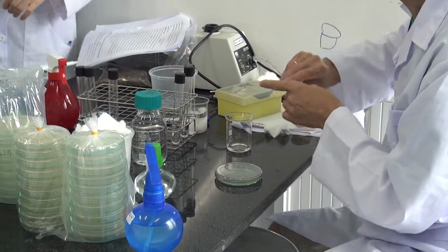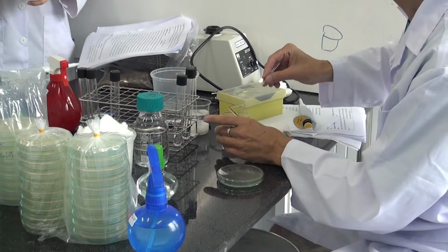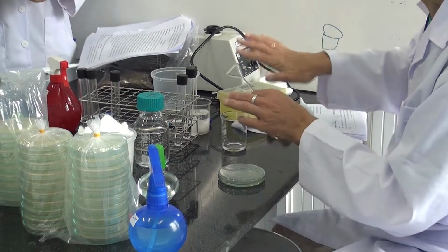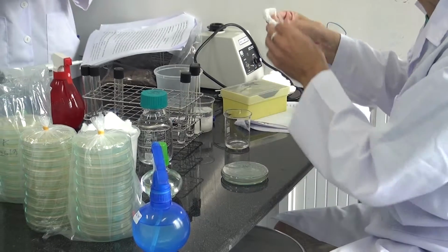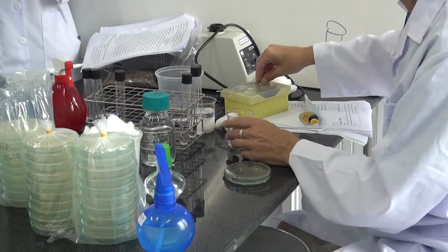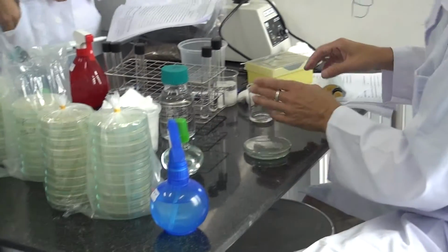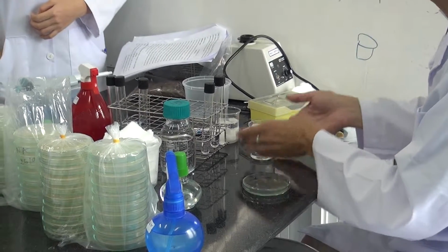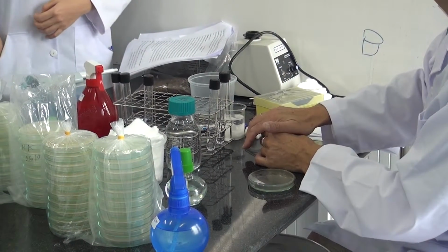Very little alcohol like this. This is sufficient. When it's done, we put some more. Okay, not a lot of alcohol, not something which is flammable, and also if we could have like a piece of aluminum foil or something. If it starts to flame, we just cover it up.